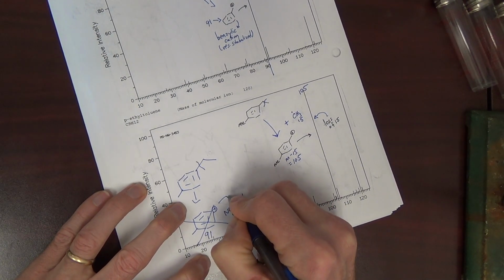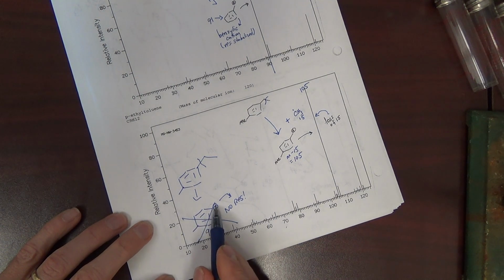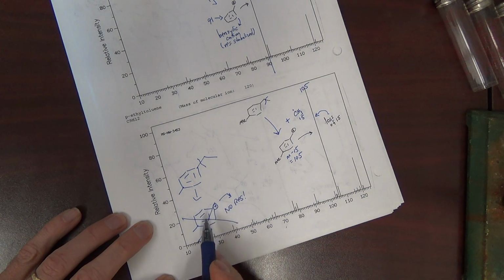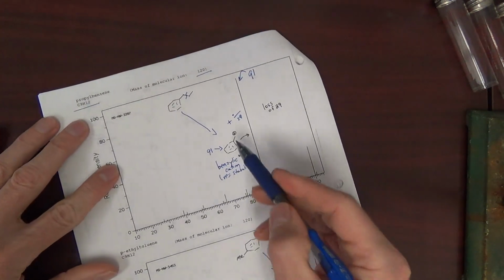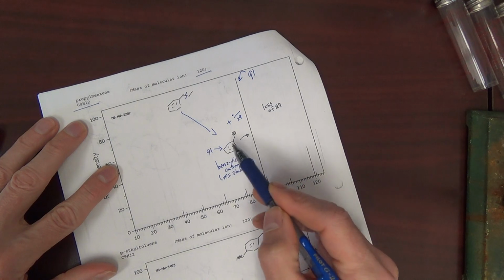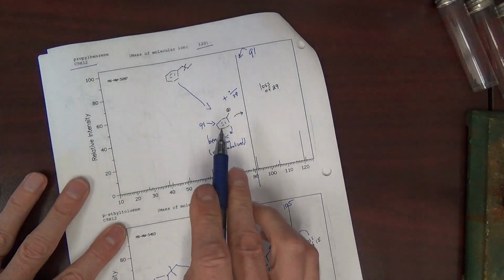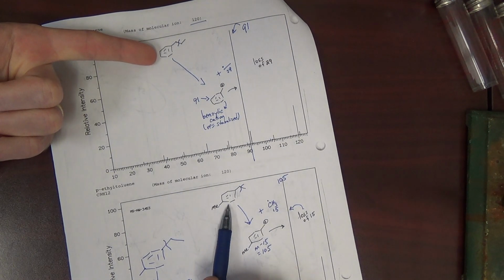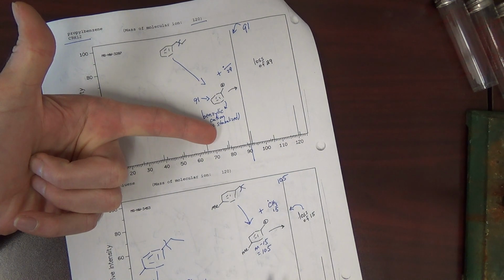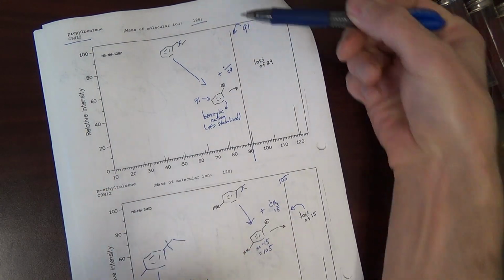No resonance. Try to draw a resonance structure of that. It is not. You have 6 p orbitals here all lined up. The new p orbital here is going to be perpendicular to the other 6. That is a single p orbital that is not overlapping with anything. On the other hand, here you have these 6 p orbitals, and then that 7th one can line up with these 6, and you have conjugation here, and you can show resonance structures here. In the end, we would predict 105 here, and we only predict 91 up here. So, the two constitutional isomers can be readily distinguished by mass spec because one mass spec has 91, the other mass spec has 105 as base peaks. Pretty clean otherwise. I mean, some minor fragmentation, but this is going to give us an answer right here, most likely.